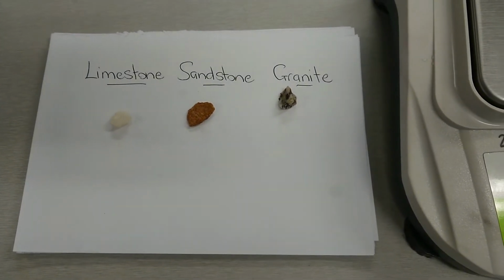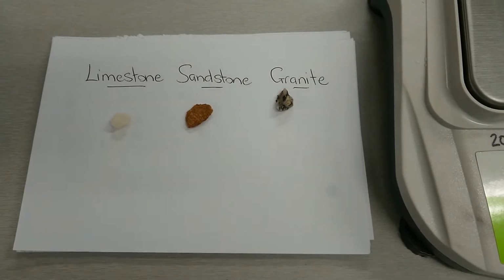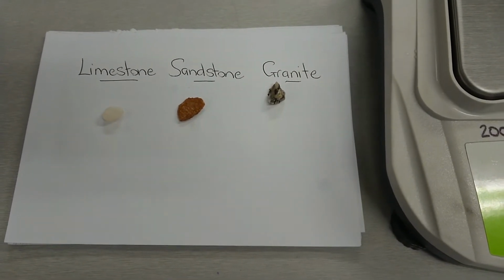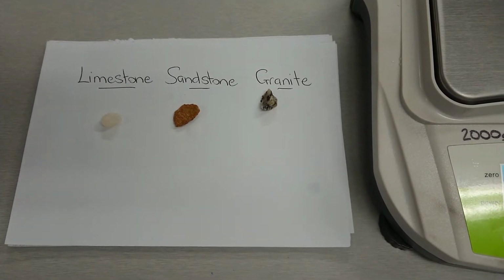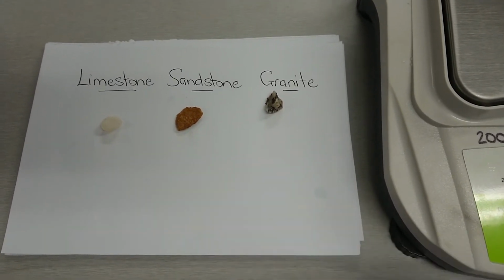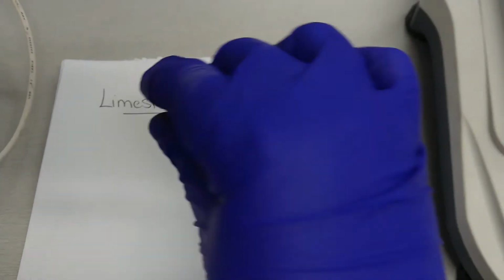Today's experiment will be simulation of weathering in rocks. So what we're going to do is take a small sample of limestone, sandstone and granite and place it in some concentrated acid. This will simulate over a short amount of time the effect of a weak acid over a long period of time. Our first job is to take the weight of each of these samples.